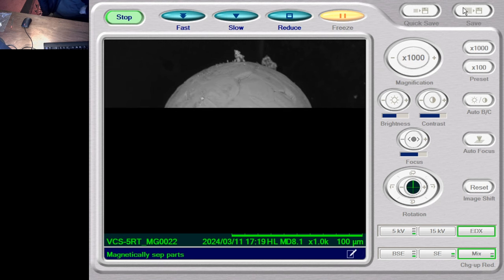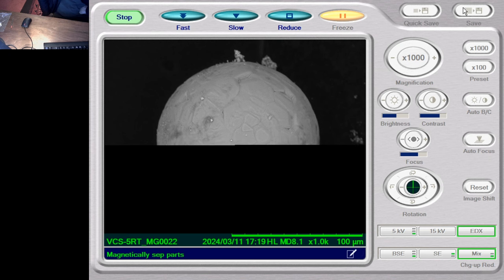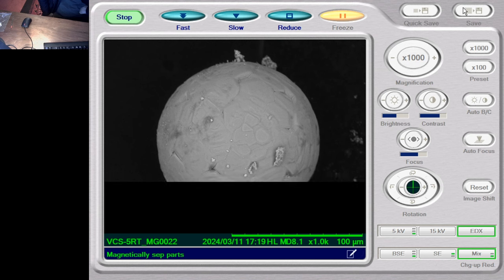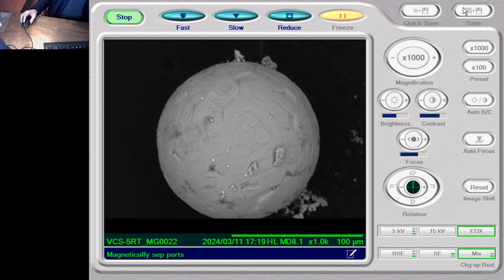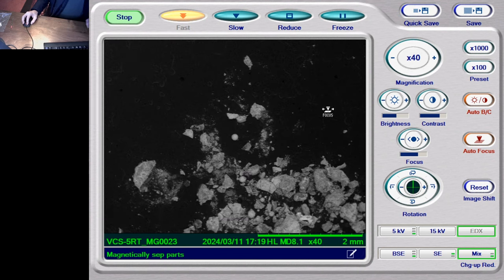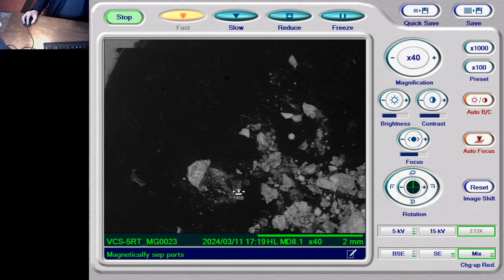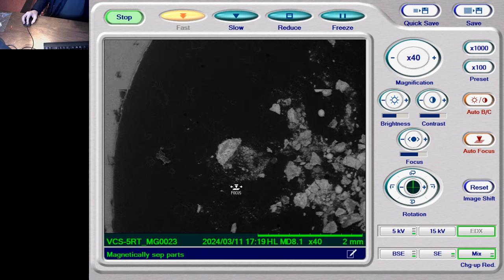So these large-scale cavitation systems do produce the very big structures. This is, I would say, around about the high 100 micron mark, which is similar to that observed by Alan Goldwater in a cavitation system. So there's one over there, which is a smallish one. Then after the break, we'll come back and look at the other sort of material that's in here that's meant to be magnetic.